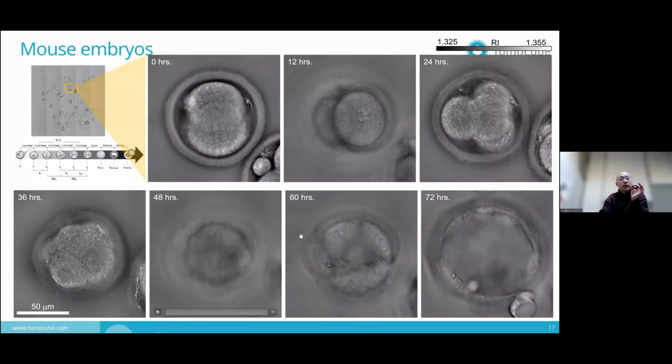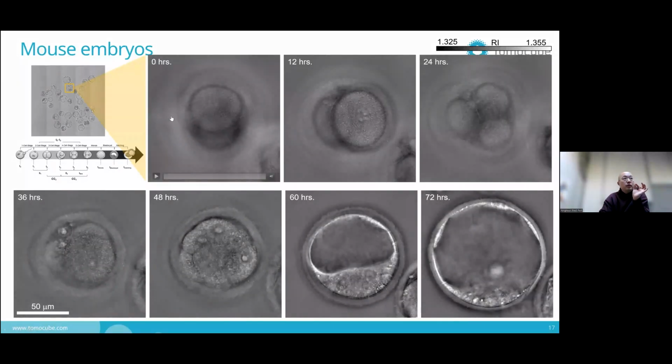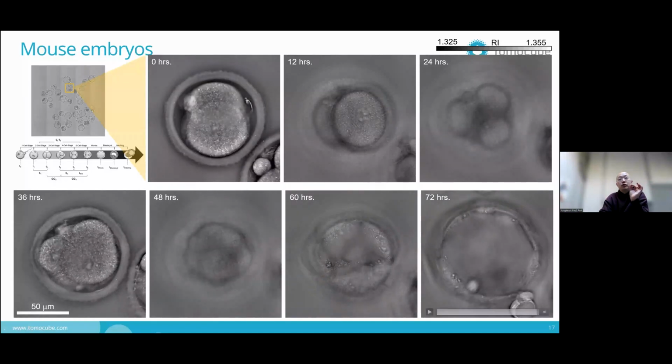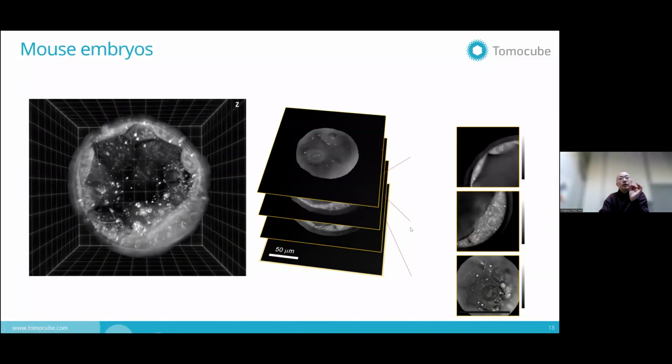So you're watching the same embryos over days, from the two cell stages up to the blastocyst stages, and you can also have high subcellular imaging capability in order to detect the nuclear membrane, nucleoli, and other subcellular structures. They are studying mouse embryos, but some of them are interested in moving toward human embryo studies. So they are working to get the certificate from the IRB in order to move on to human embryos. I think it will be very interesting to see human embryo data without any photobleaching and phototoxicity issues.